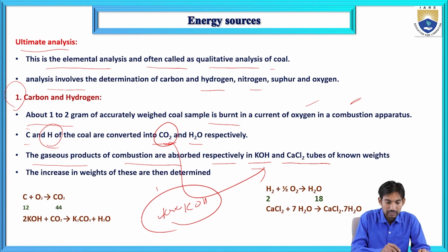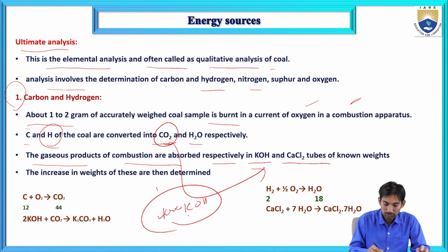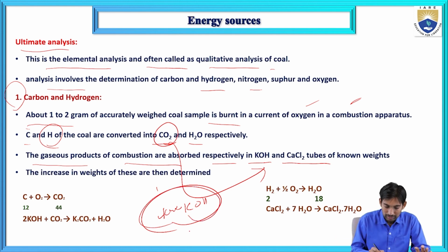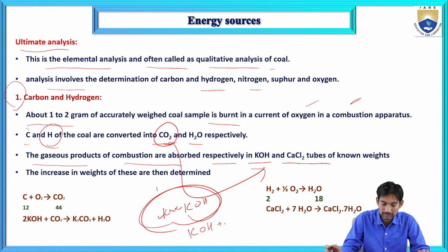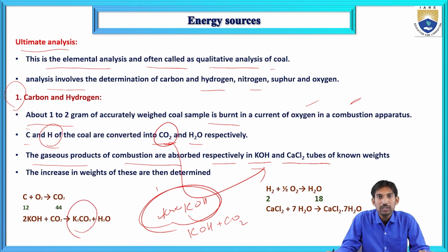Here the potassium hydroxide reacts with the evolved carbon dioxide gas. It produces K2CO3, potassium carbonate, and releases water molecules.